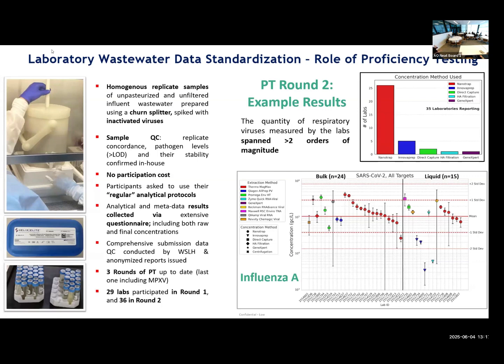We are doing it by turbidity, but then we also do, for our internal knowledge and to make sure that what we're sending out, internal analysis and replicates, right? To make sure that we have really tightly matched replicates, and that we have a level that we were targeting that is detectable by everyone. So we're shooting for something that is definitely way over the limit of detection for the majority of methods. And we've done a bunch of different methods in the lab, so we kind of have an idea. Obviously, we haven't done every method out there.